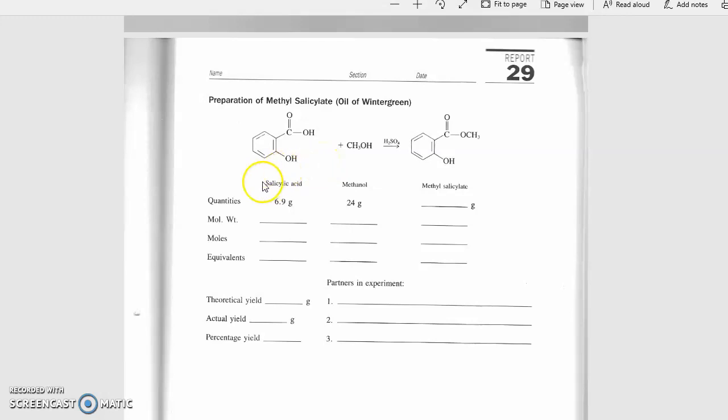Okay, so organic chemistry can be very, very precise. You have to know exactly what conditions and how you can carry them out and what will allow you to have something take place at this place versus this place.